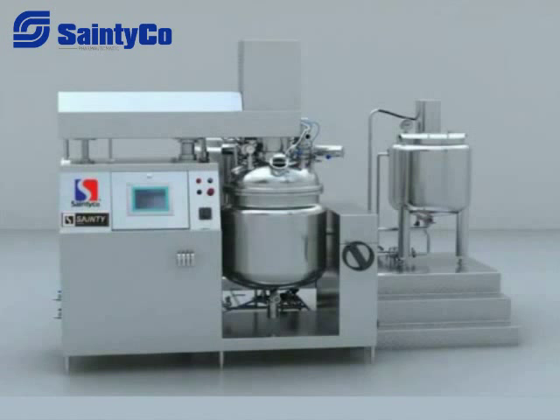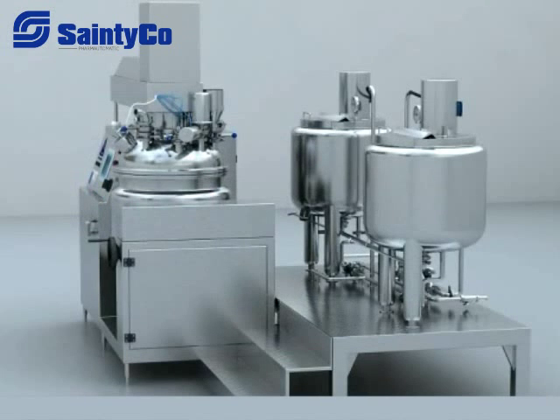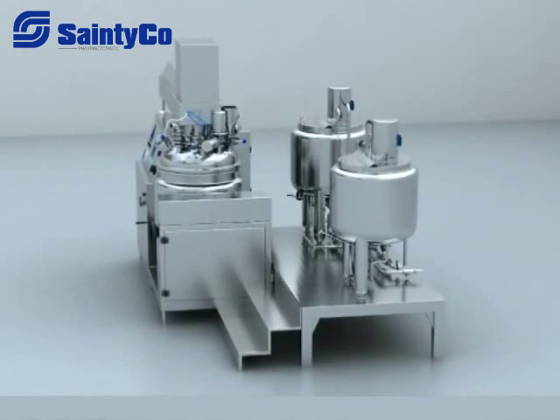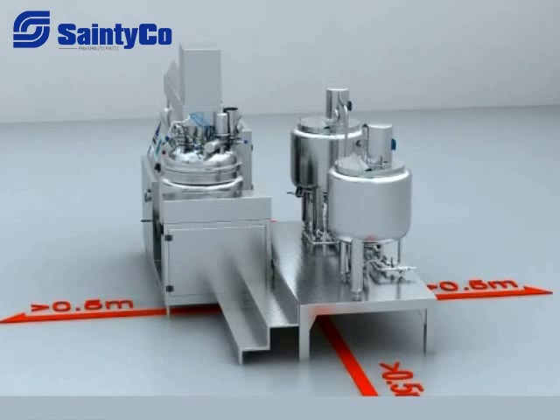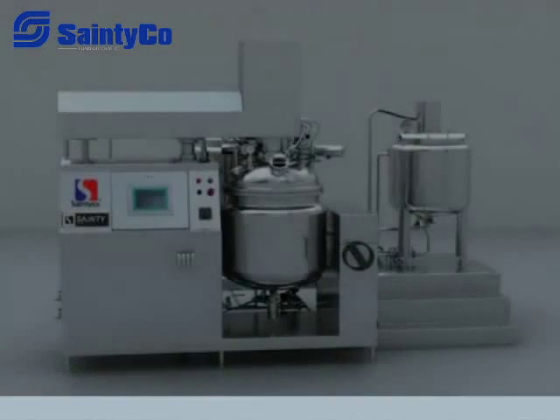Installation. 1. Place six main machine pads after the main machine and working table enter the workshop, put the main machine on the pads, then use a level bar to adjust the level of the main machine. 2. Put the working table behind the main machine and the stainless steel ladder by the side of the working table so that the ladder and table are aligned in one line. 3. Connect the stainless steel pipe and compressed air pipe between the main machine and working table, and connect the steam pipe, water inlet pipe, water discharge pipe, condensed water discharge pipe, and compressed air inlet pipe between the workshop and the emulsifier. 4. The emulsifier should keep a distance from the wall of at least 0.5 meter, 1.0 meter if possible, in order to allow maintenance and ease the cleaning process.